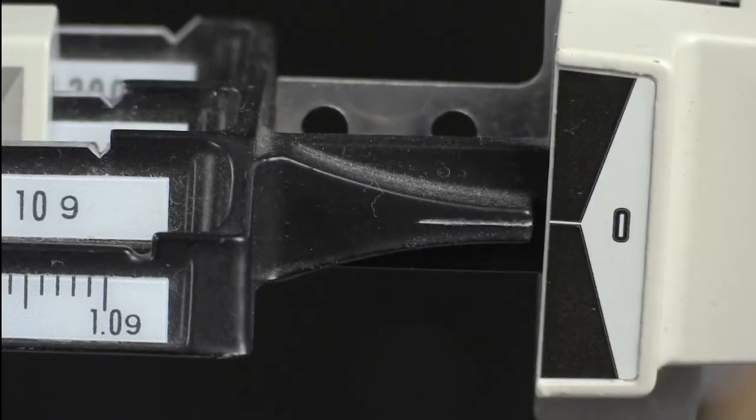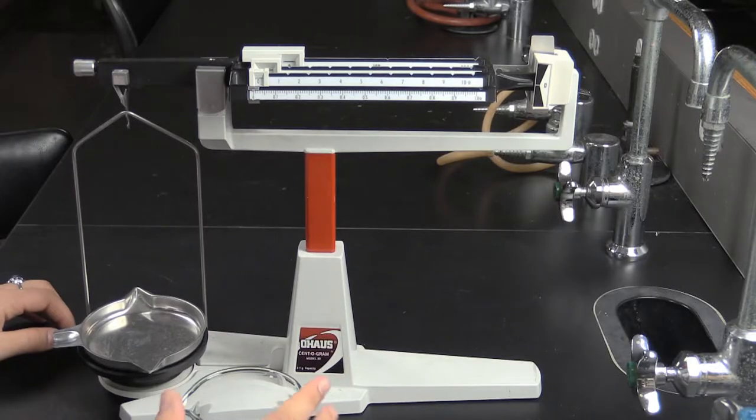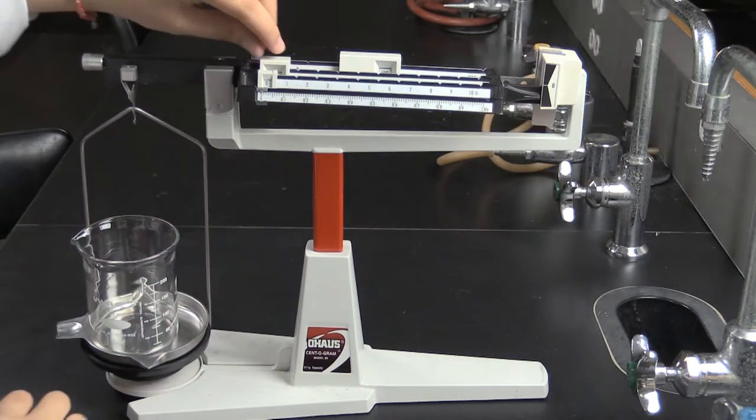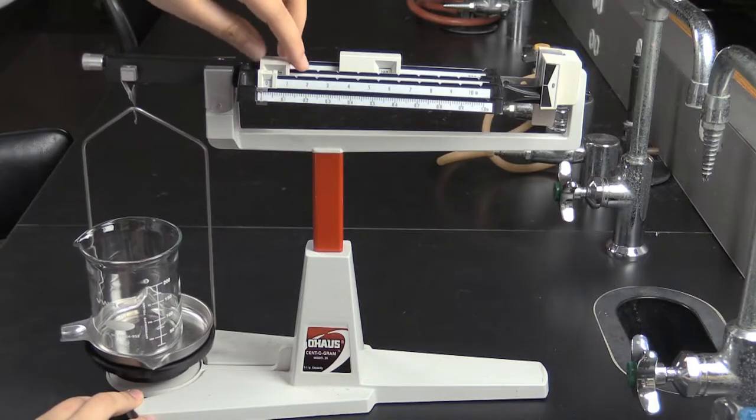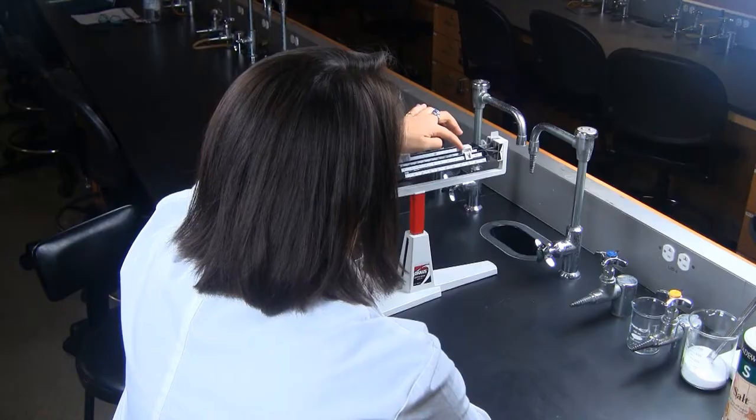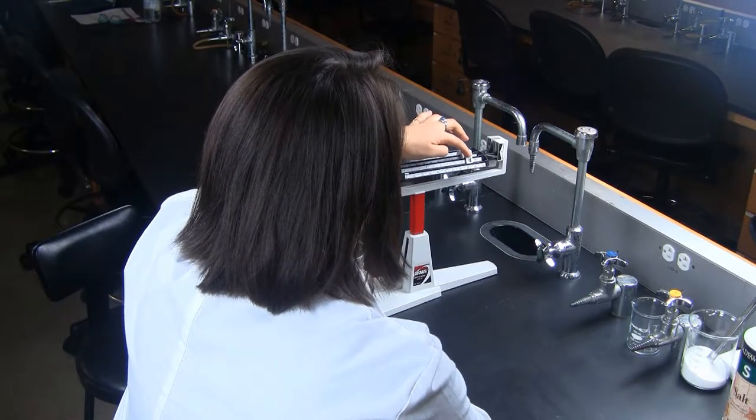Once the balance is zeroed, you are ready to take a measurement. Ileana is going to measure the mass of a beaker. When she places the beaker on the balance pan, it will go out of balance.